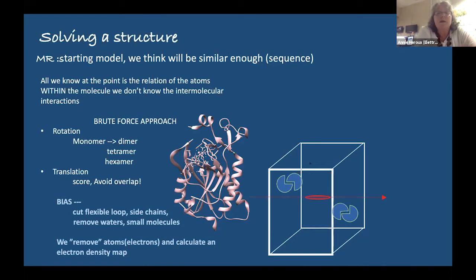Of course, this is a little bit more complicated because proteins are extremely flexible. So even though it's the same protein with one different mutant, it will breathe, it will have a different conformation. And very often this is what you actually want to study.